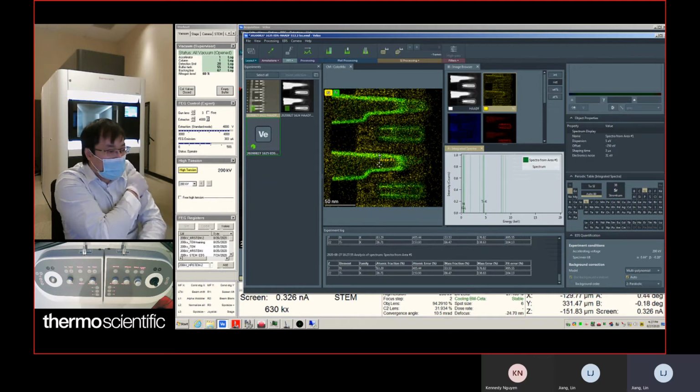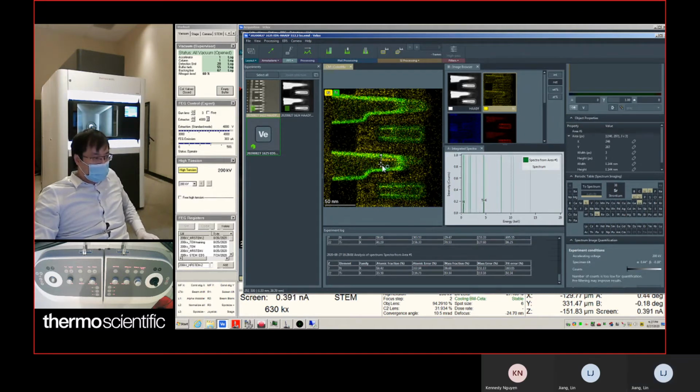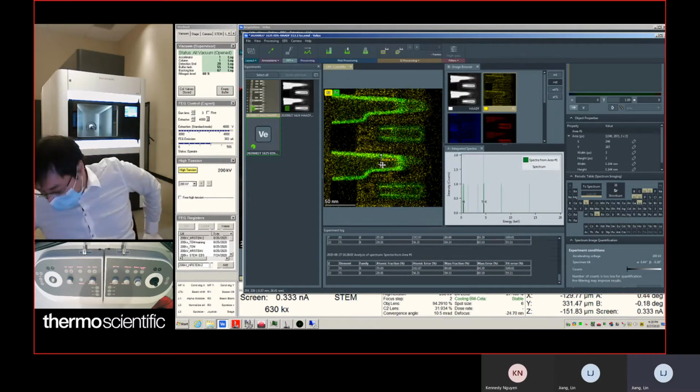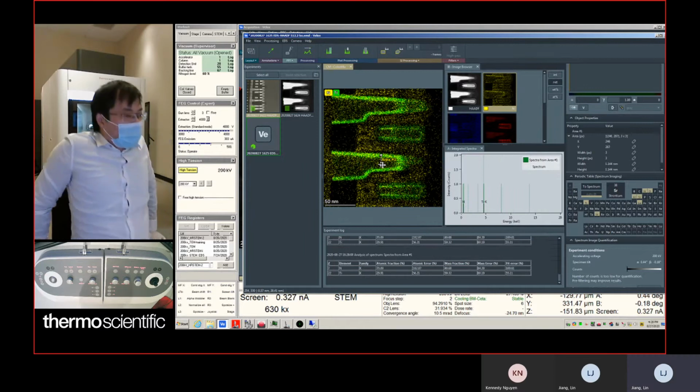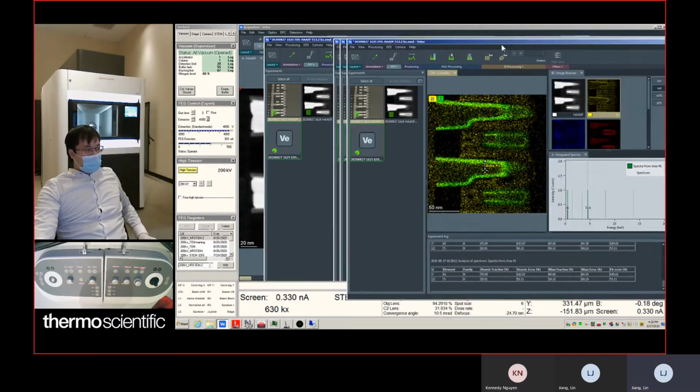We have a lot of error for the titanium, because your dwell time is too small.